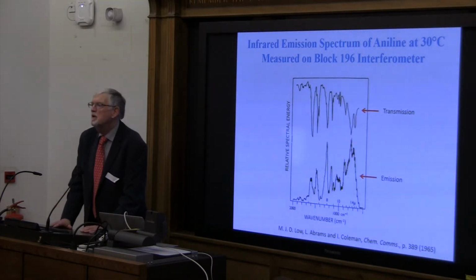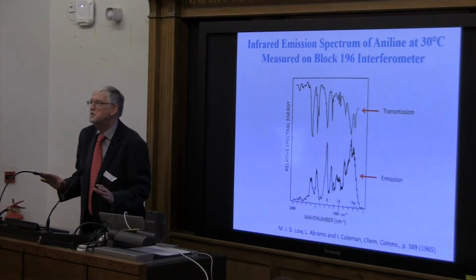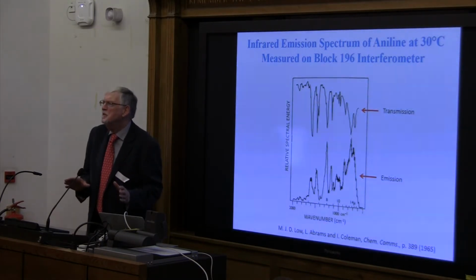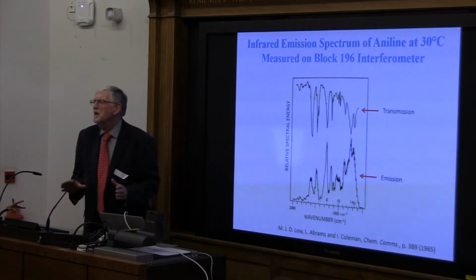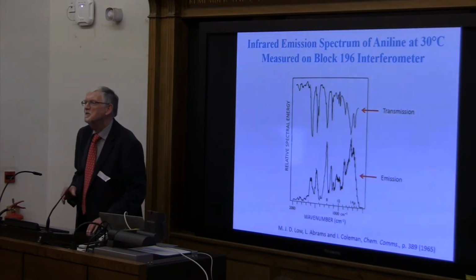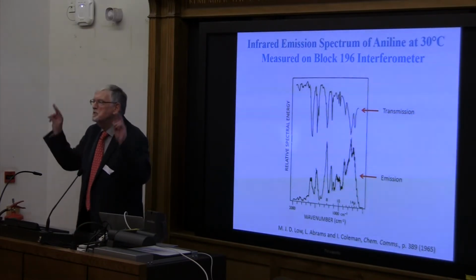So Lippincott came to me and said, "You're the only person in this group who's used an FTIR spectrometer." I was working on a non-spectroscopy project. After spending 3 years with the RIIC FS-520, I never wanted to see a Fourier transform spectrometer again in my life. Anyway, he put me and a very talented grad student onto this, and we started playing in our, quote, spare time.